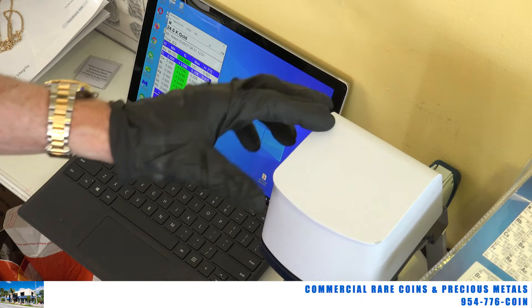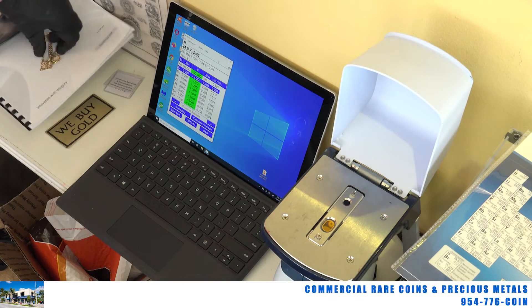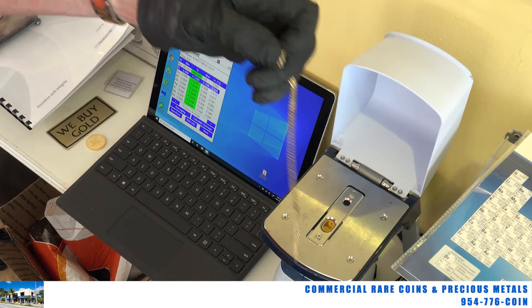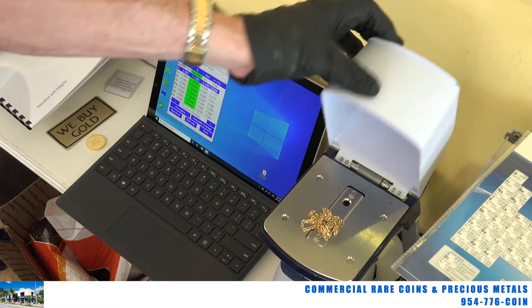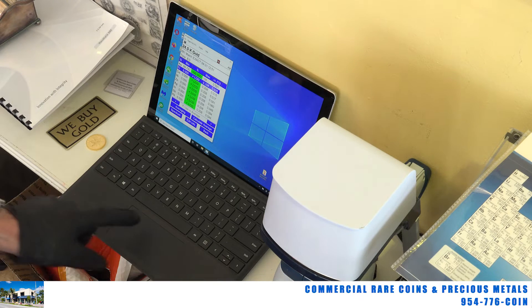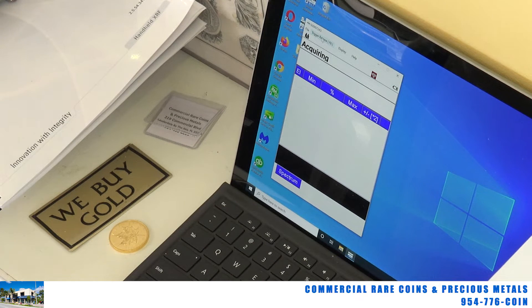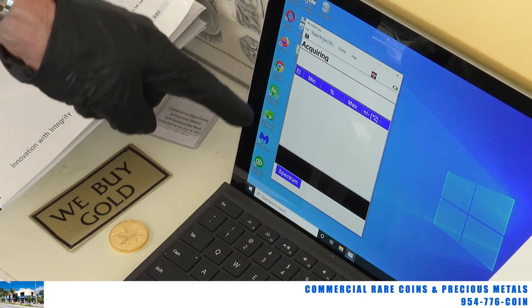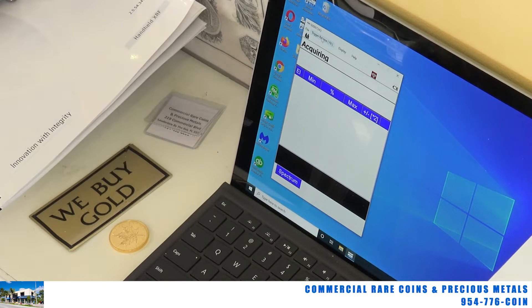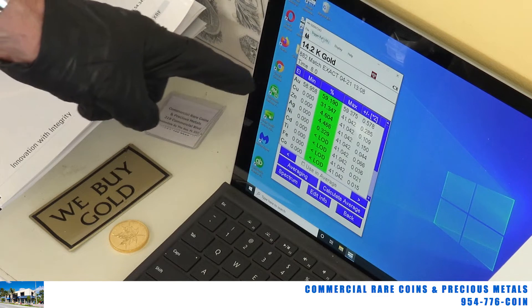I'm going to put a piece of jewelry in here now. We're going to pull that gold coin out and stick in a little piece of 14 karat jewelry, because you're going to get to see all the different metals that are in a piece of jewelry like that. I'm going to hit the trigger up here, and as you can tell, it's acquiring the information and the elements should come up. We've got 14 karat here, which I expected to see.